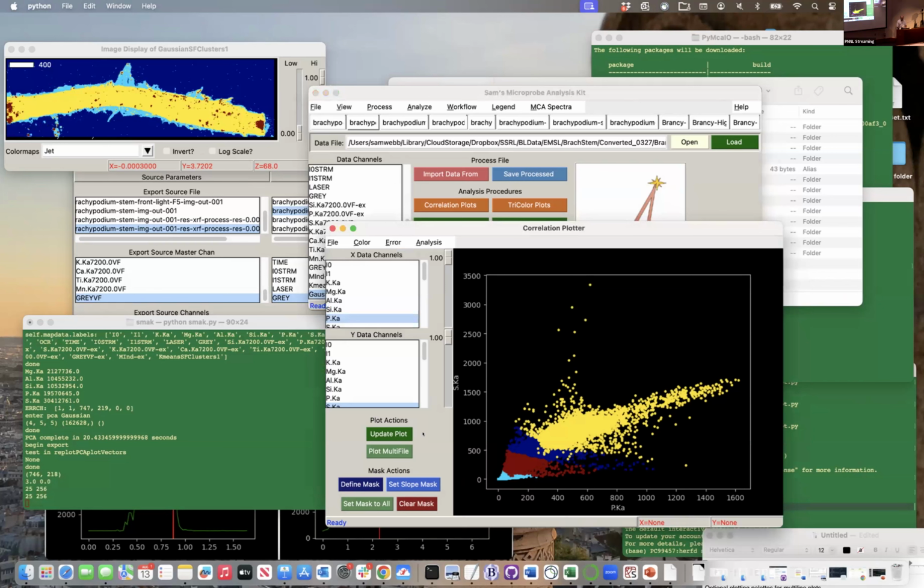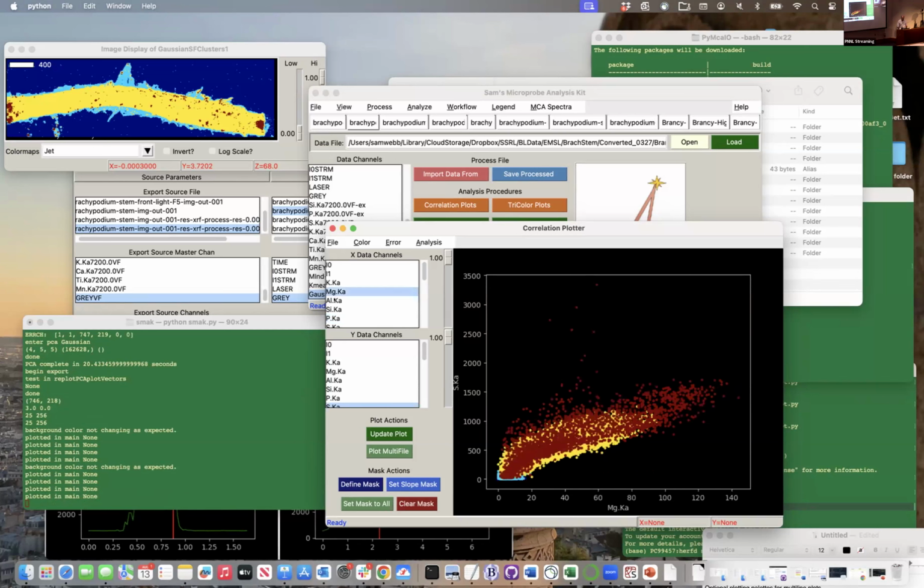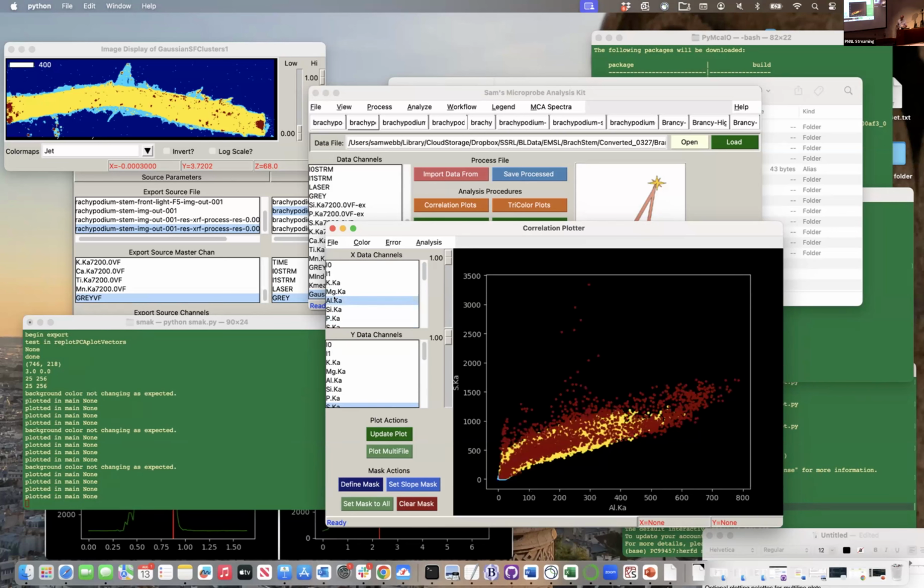And if I look at my plot here, it's not geometric at all. I'm just showing phosphorus and sulfur, but it's weighting those other channels a little bit nicer in that sense. And you could say maybe it was picking up magnesium, but it's picking up clusters of a higher dimension than I can see in 2 dimensions. And I find this to be much more meaningful than K-means. K-means really biases things on the highest concentrations of stuff. So personally, that's why I love Gaussian, and I tend to disapprove of K-means. Thanks.